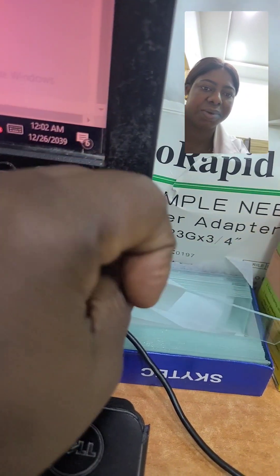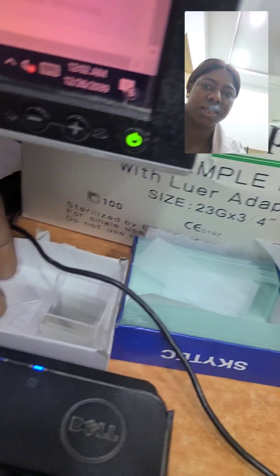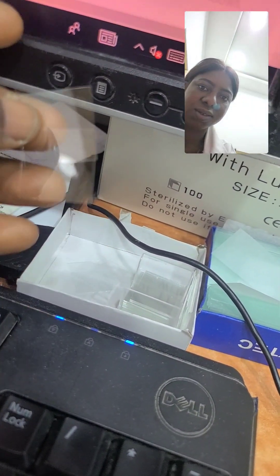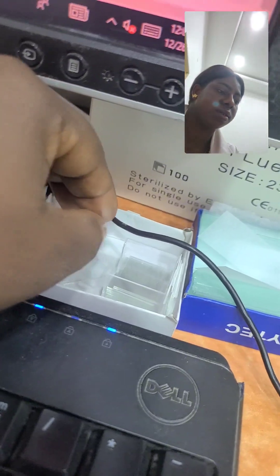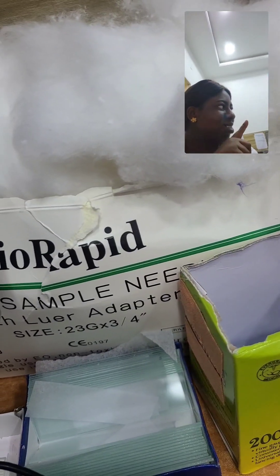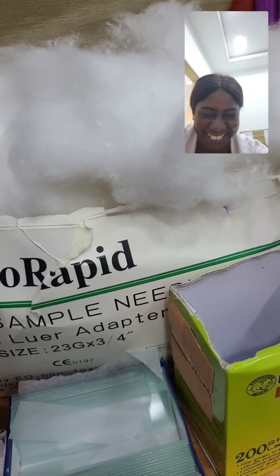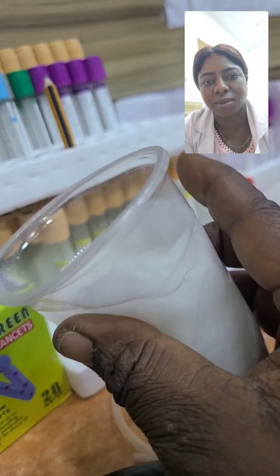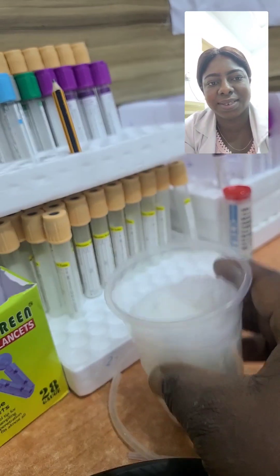Here is a micro slide and a cover slip. We use them to view something under microscopy. Like what we do on this table in the lab — we use it for malaria testing: we prick the finger, get a drop of blood, and drop it on the slide.